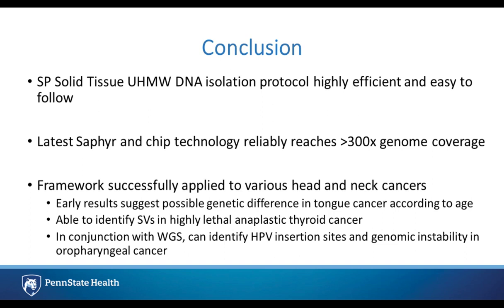Thank you. Now, Dr. LaBarge, have you tried calling structural variants based on the whole genome sequence data? We are looking into that, particularly for those HPV samples, to see what variants we can call by whole genome sequencing. And then we're going to follow that up by comparing to the optical mapping to see how much overlap there is, or if there are different types of SVs that we're detecting on the different platforms.